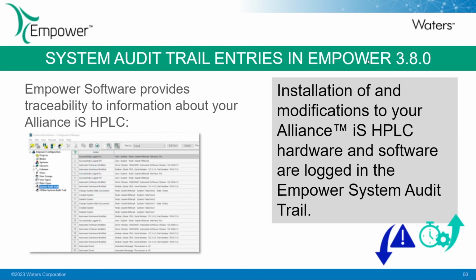Okay. We've also enhanced the system audit trail in Configuration Manager when there are modifications to the configuration of this instrument. So there's a bit more detailed information if you look at the system audit trail within the Configuration Manager window.